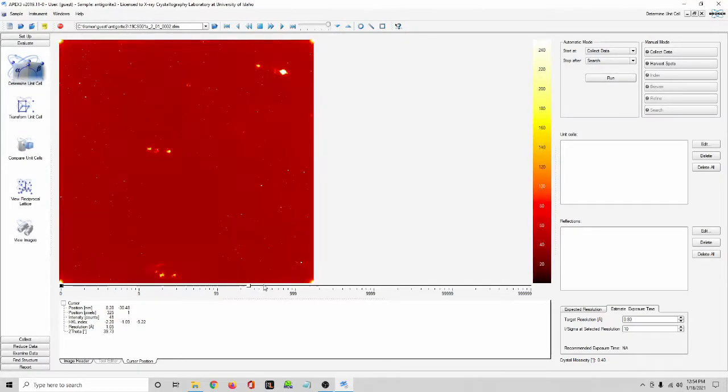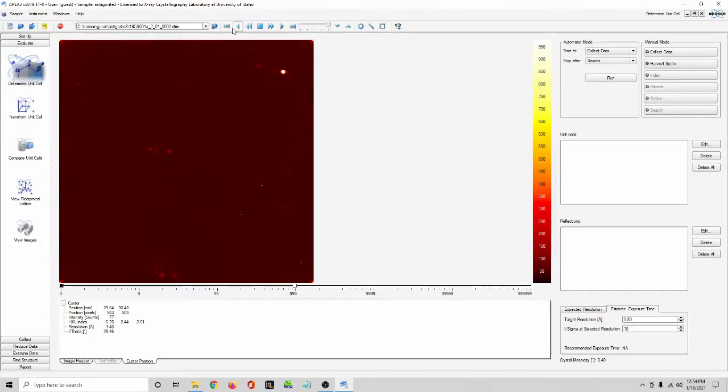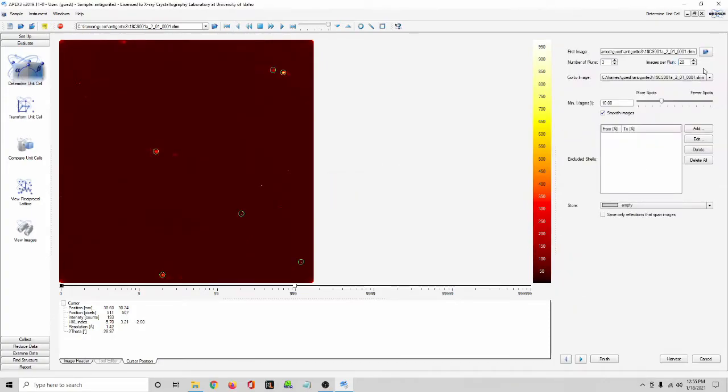And this doesn't look great, but this crystal is kind of crappy, so we'll do what we can with it. But these are okay. It's good enough for our purposes here. We'll go to harvest. And our minimum intensity, we'll just go 20, which is pretty typical. It already knows the folders to go to.